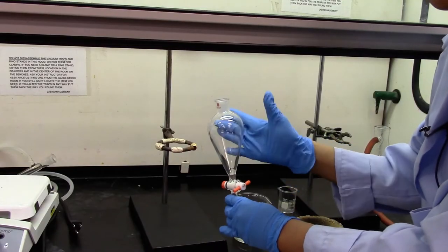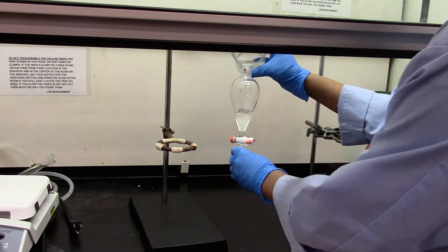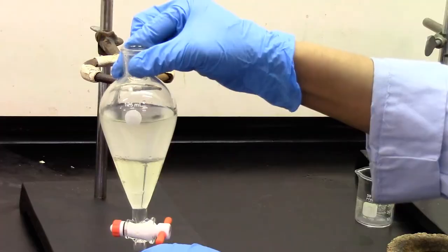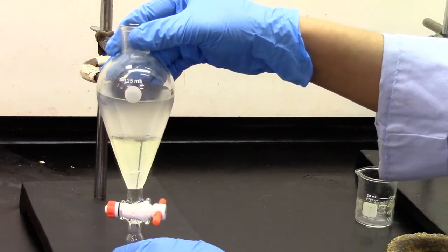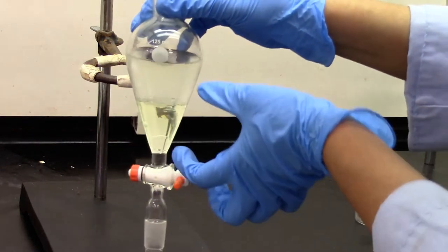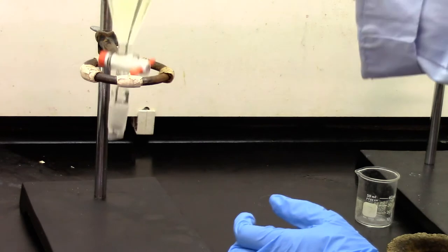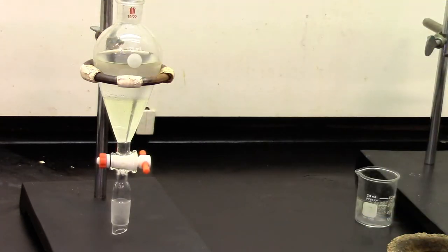Transfer the product into a separatory funnel. We can clearly see two layers. We're going to transfer the bottom layer, which is the dichloromethane layer, into a clean Erlenmeyer flask.